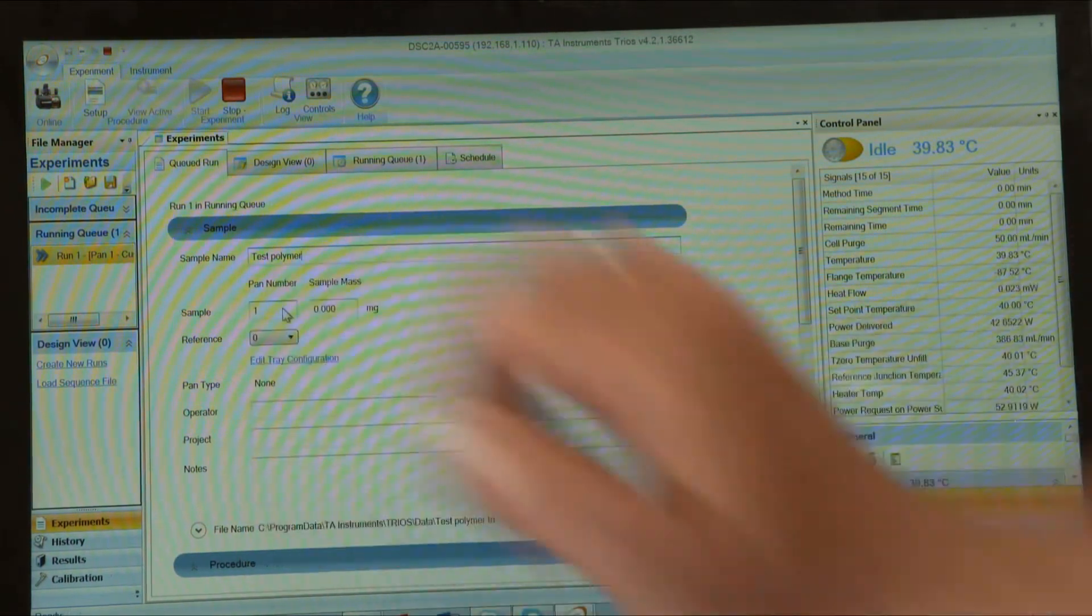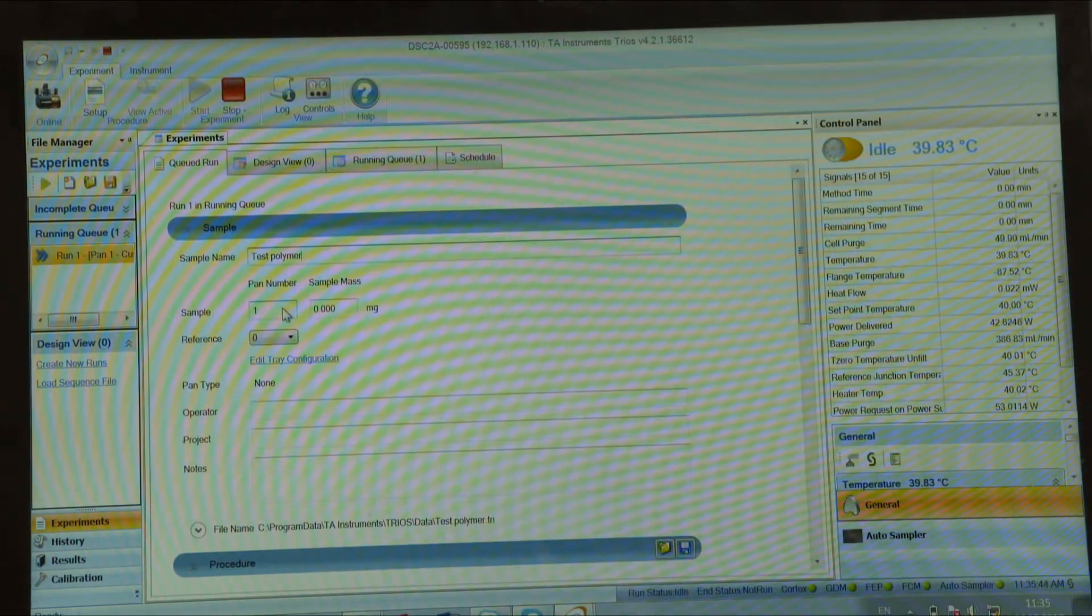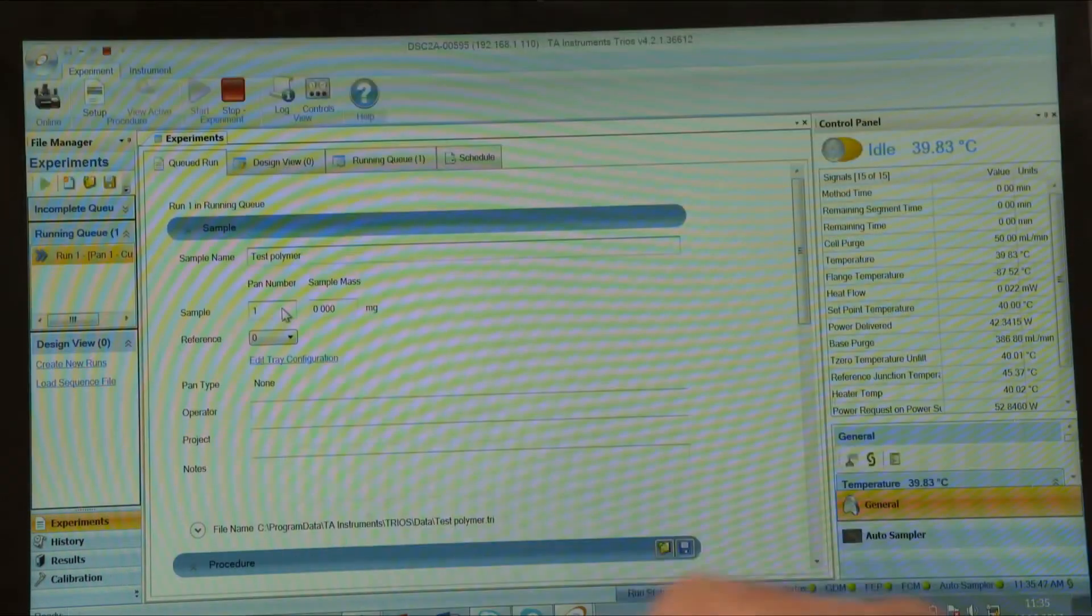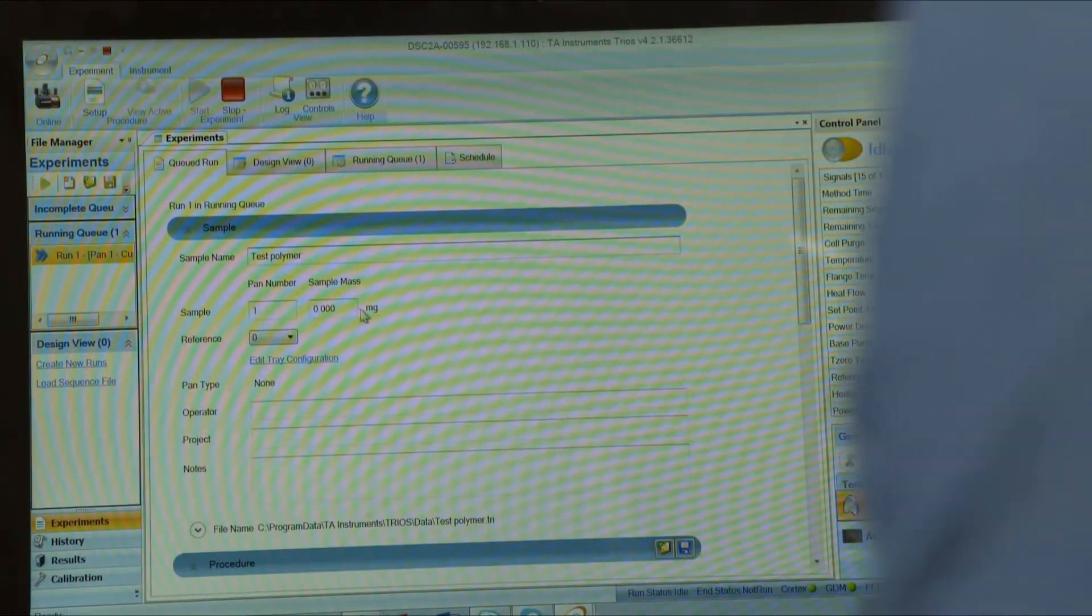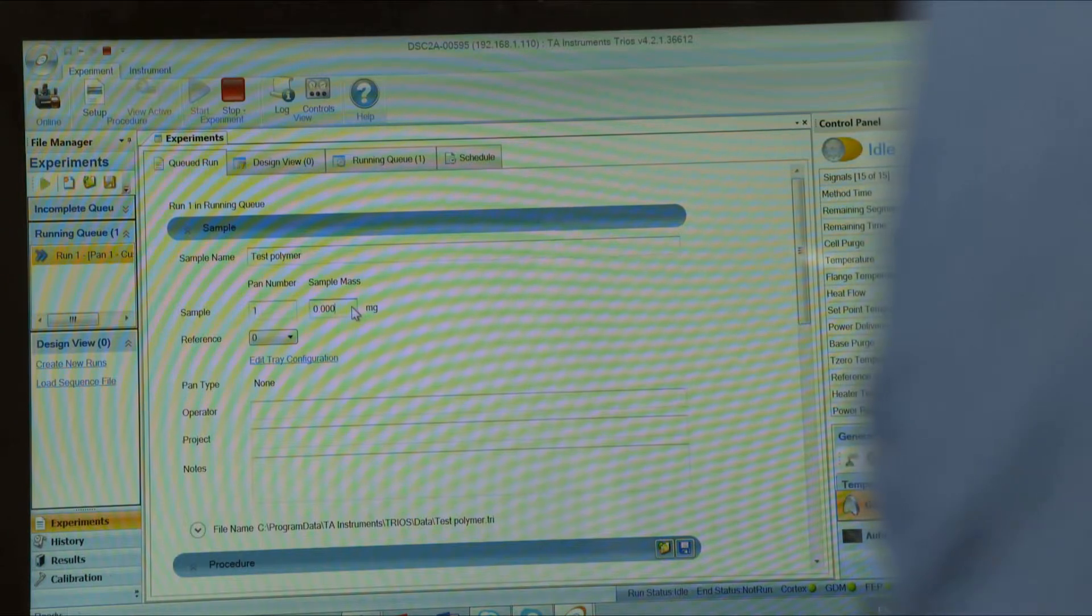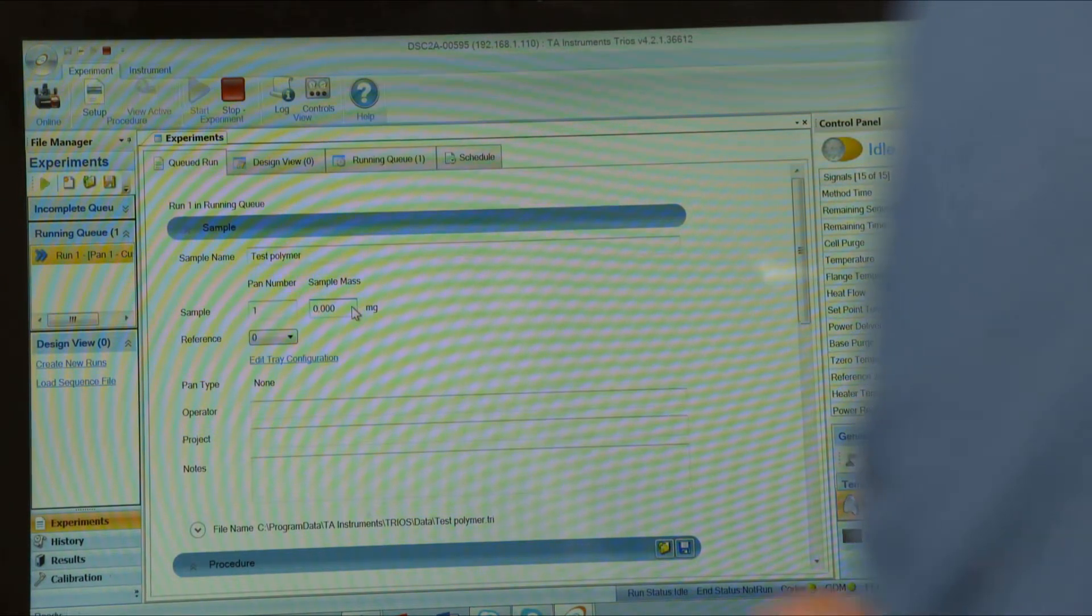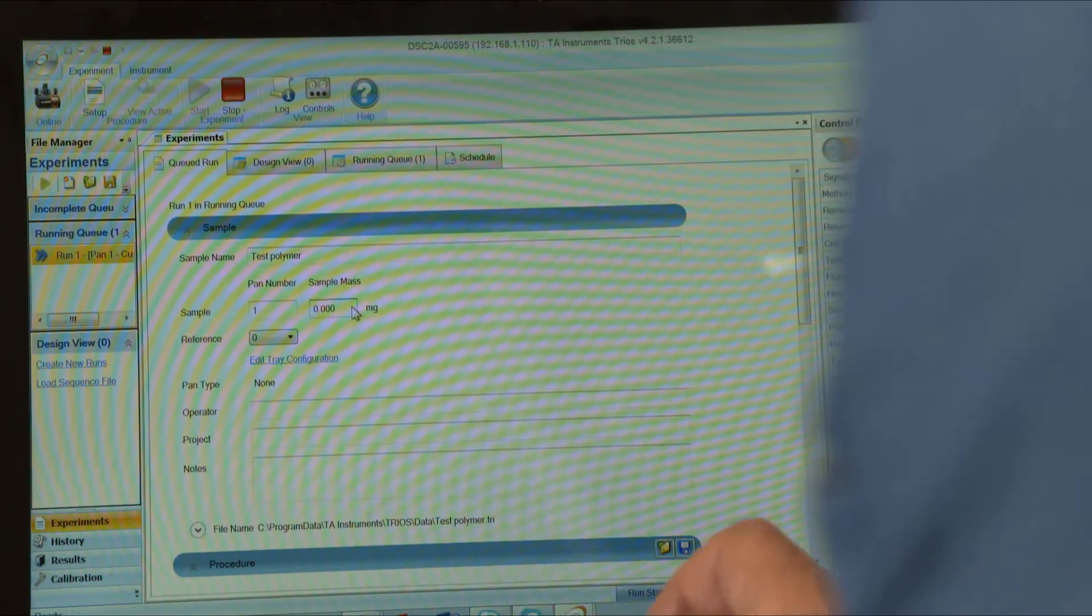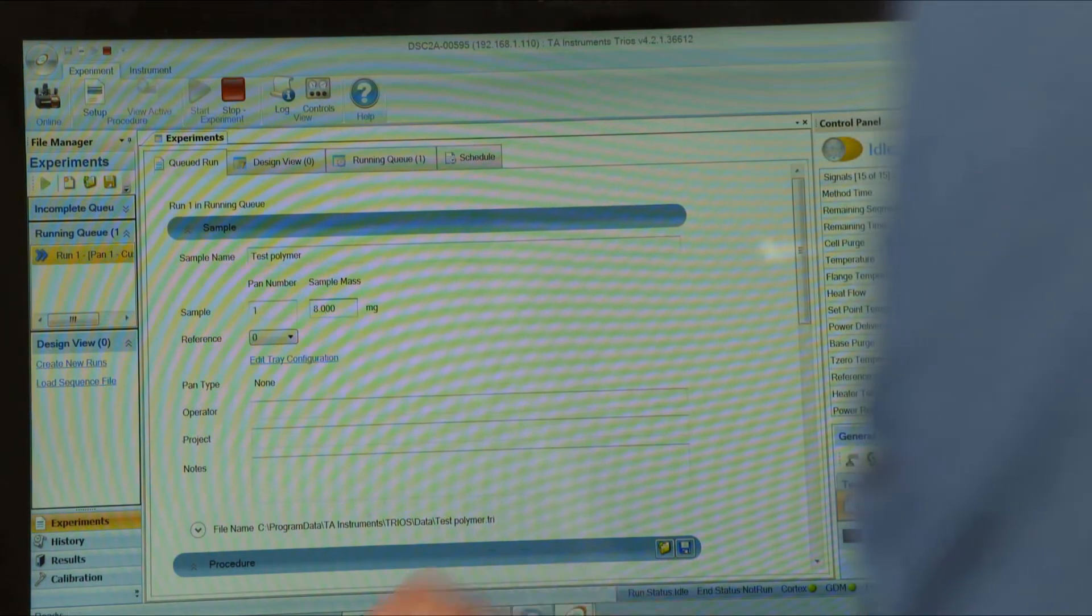You have to put the position in which you put sample on the tray, so position one. You need to know the weight of the sample: 8.3 milligrams.